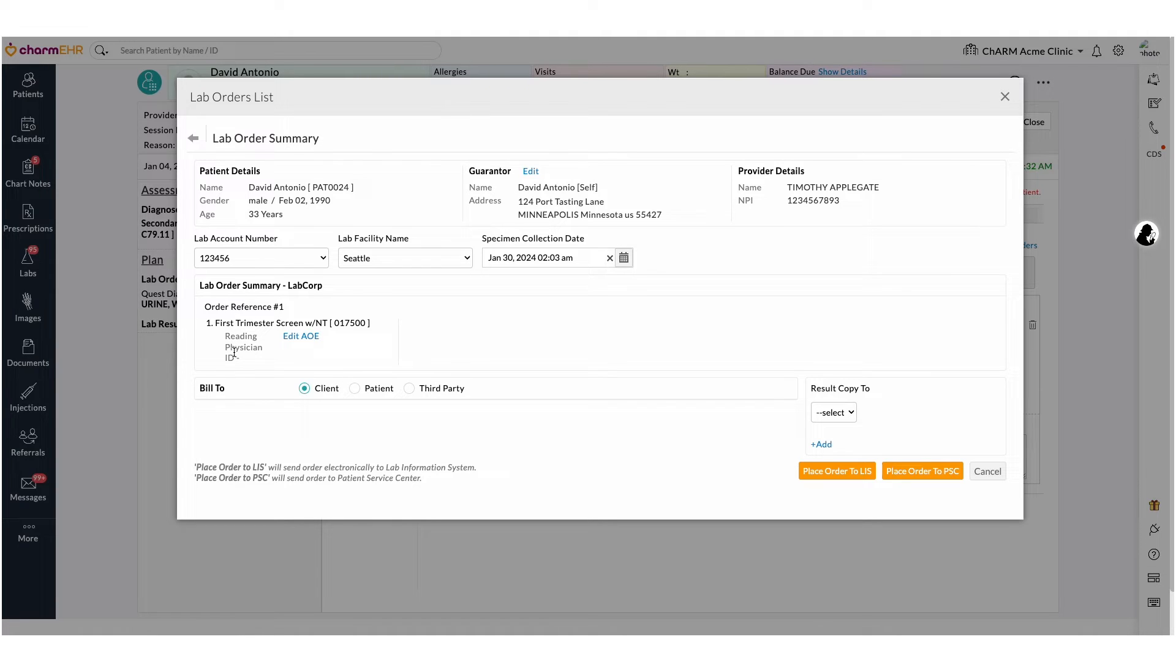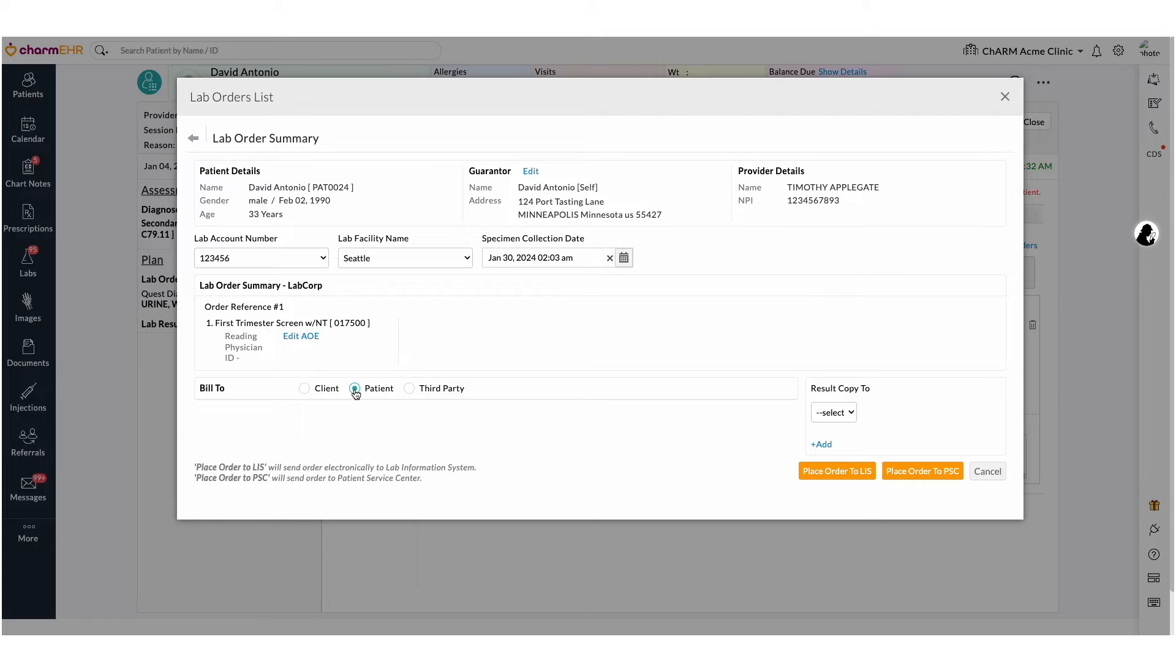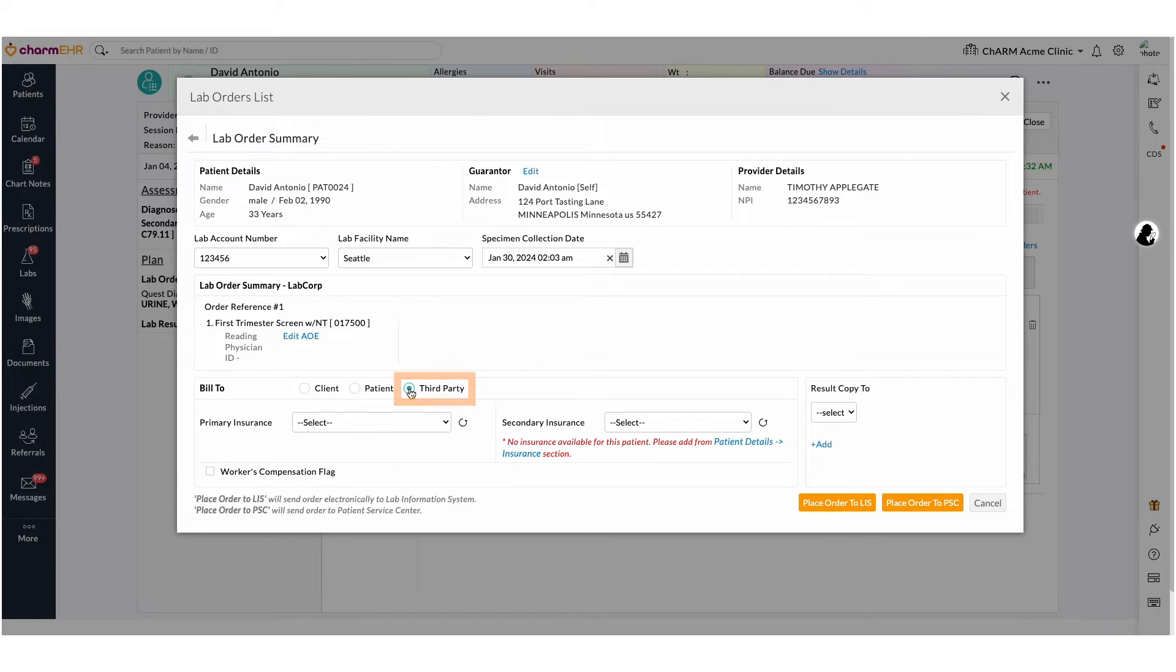If the bill is client, practices take responsibility to pay the lab fee. If the bill type is patient, the lab fee will be paid by the patient directly to the laboratory. If you select the third party billing, then the lab fee will be paid by the insurance company.